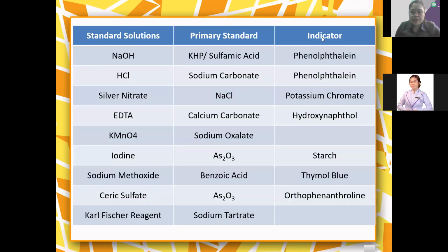So meron tayong examples here. Kasi pangutanong ko niyo, ma'am, memorize na. Oo, memorize ninyo ni, kasi tinatanong din ito sa board exam. So we should know what will be the chemicals na gagamitin natin if we want to standardize a certain solution.